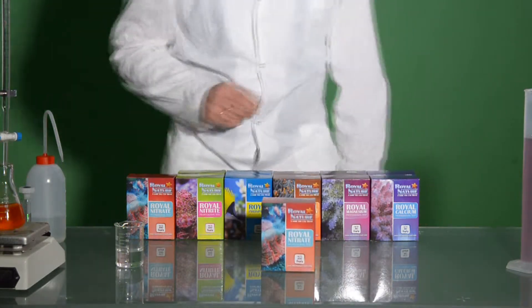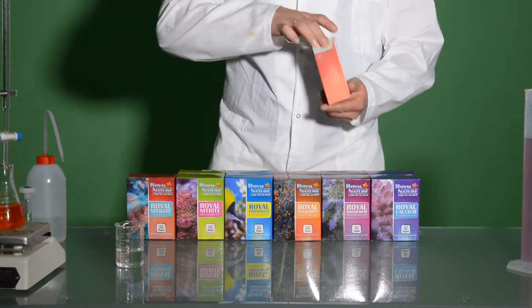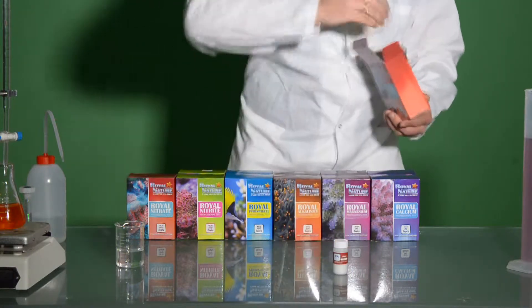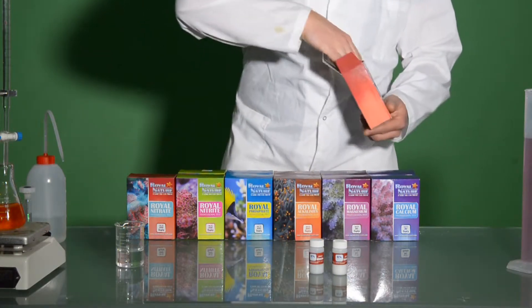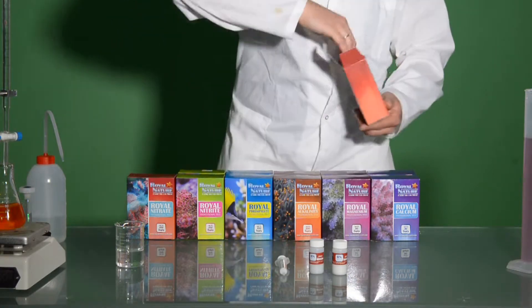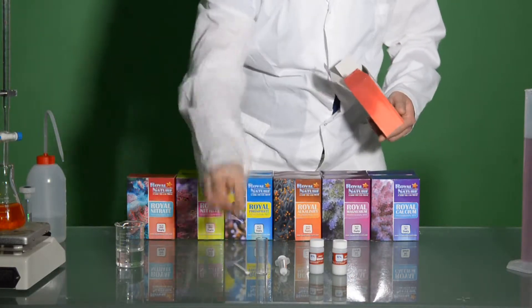Two steps only. We'll open the box and see what we have inside. We will find two kinds of powders: the first one marked NO3-1 and the other one marked as NO3-2. Also included are a 5 ml syringe, a test vial, and a measuring spoon.